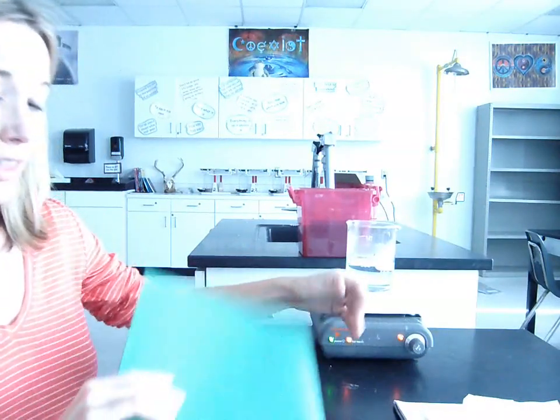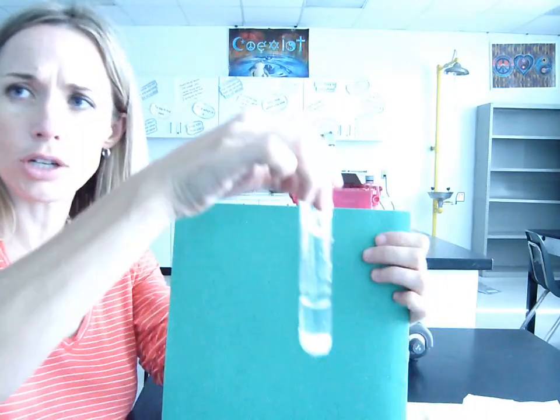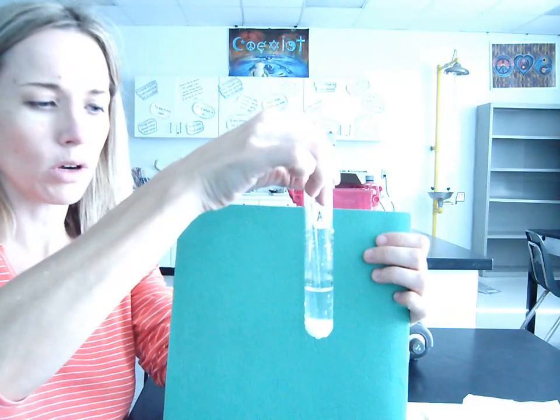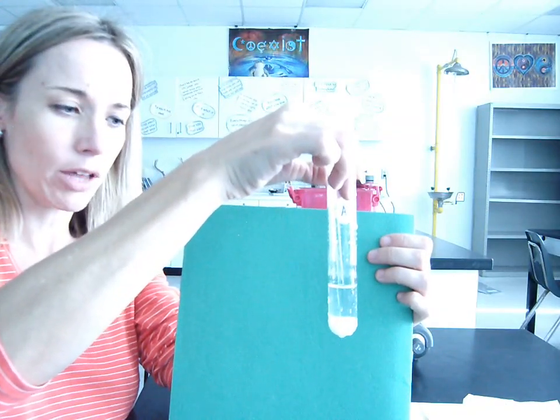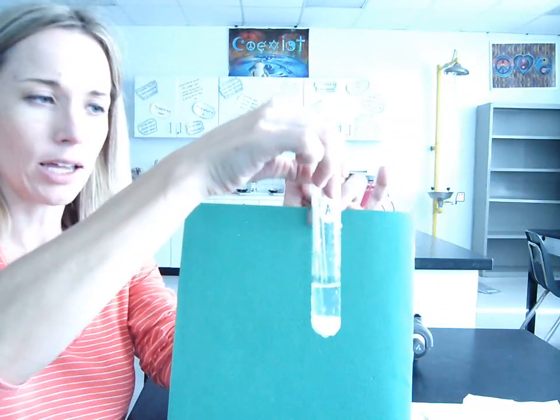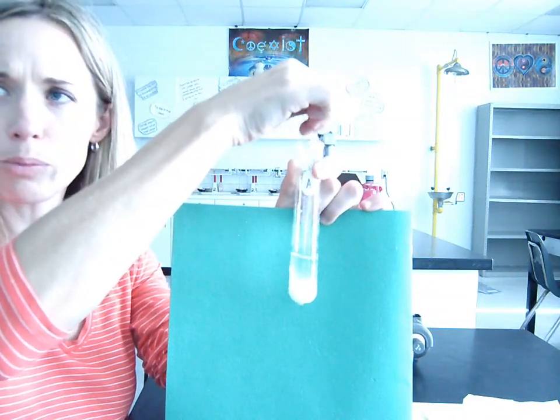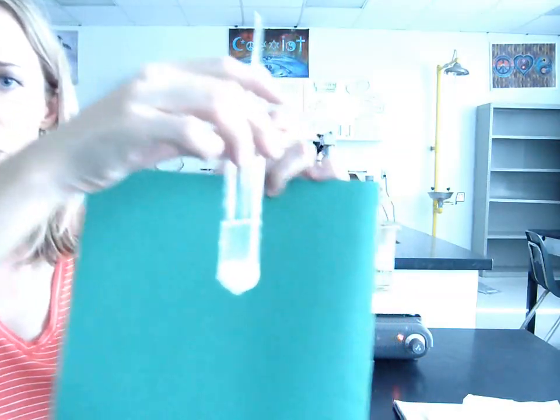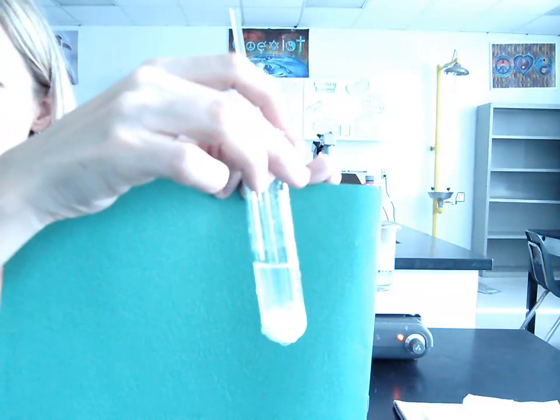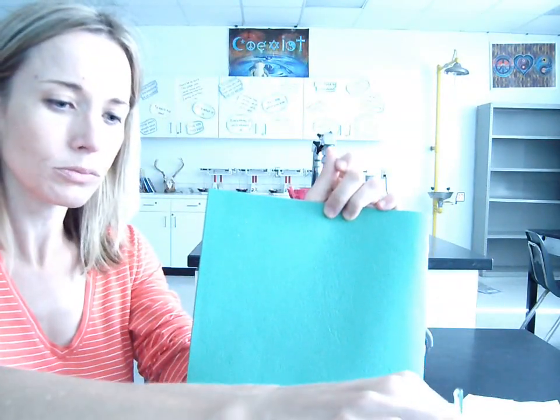One with a substance that we're going to call A. And what I did was I took 10 cubic centimeters of water and 10 grams of substance A, and I mixed them together. What you should notice is that at room temperature, substance A does not appear to be very soluble. There's a lot of substance left over in the bottom of that test tube. You can see that okay? So substance A is not very soluble at room temperature.